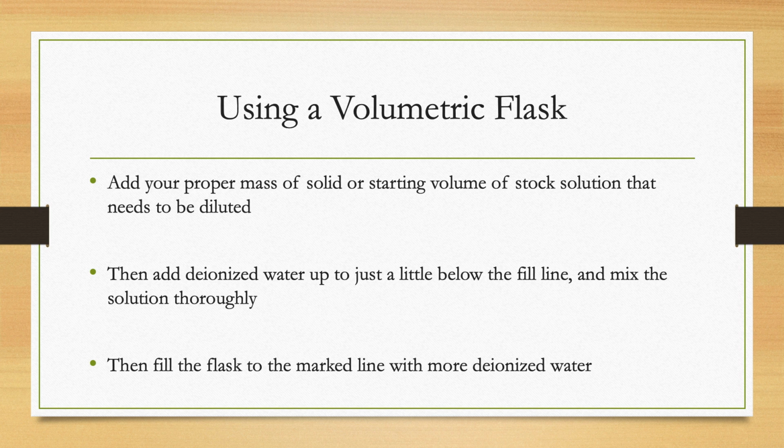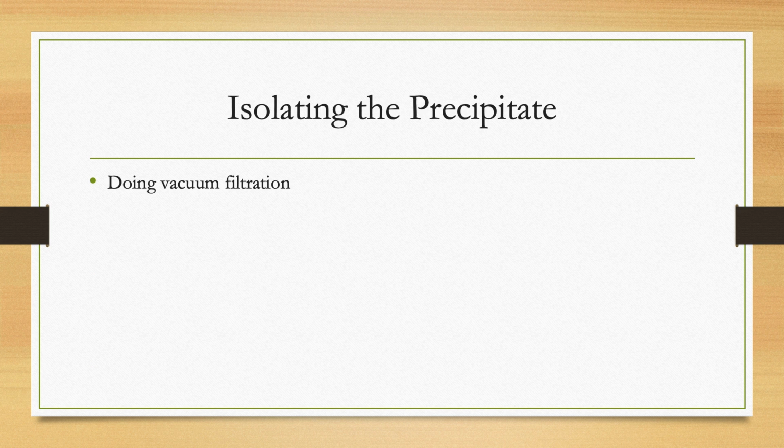Glass ones are extremely expensive, which is why we are using the plastic ones for Gen Chem, because we know accidents happen and things get dropped. So it's a little bit of a safeguard, but these things are still very accurate in terms of the volumes that you're trying to measure with them. That's the general procedure you'll be using for those volumetrics to make your solutions.